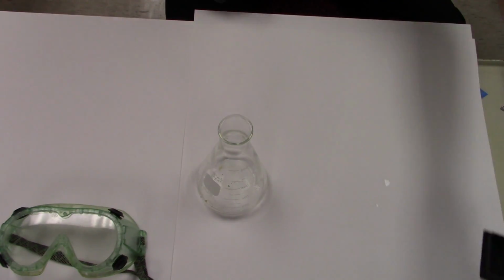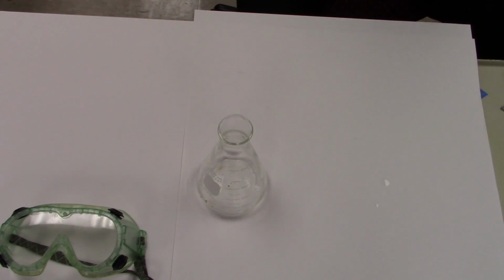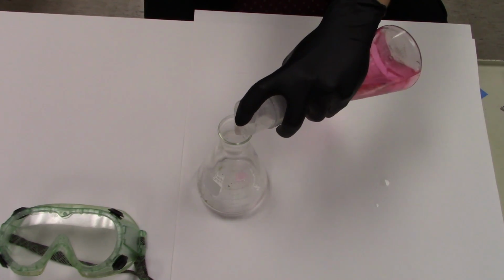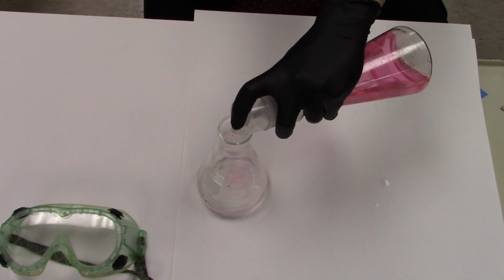Now hydrogen peroxide, have you ever heard the joke? Two guys go to a bar, one says, I'll have H2O, and the other guy says, I'll have H2O too. The second guy dies. Have you ever heard that joke? Yeah.